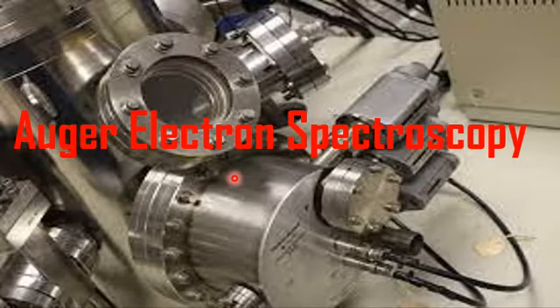Dear student, please note that the penetration depth from which Auger electrons are produced is in the range of 3 to 10 nanometer. So Auger electron spectroscopy can only give us information in the range of 3 to 10 nanometer.